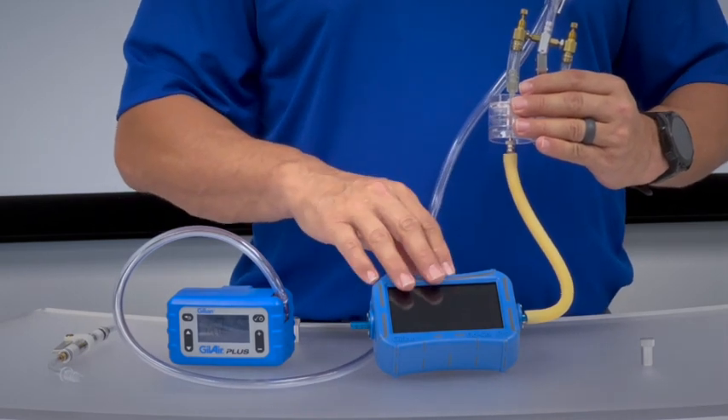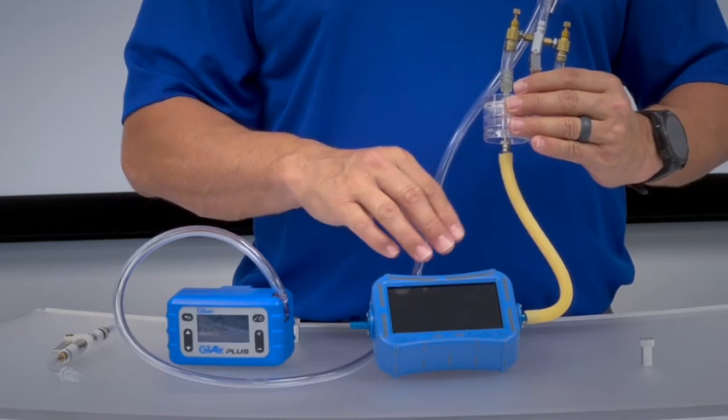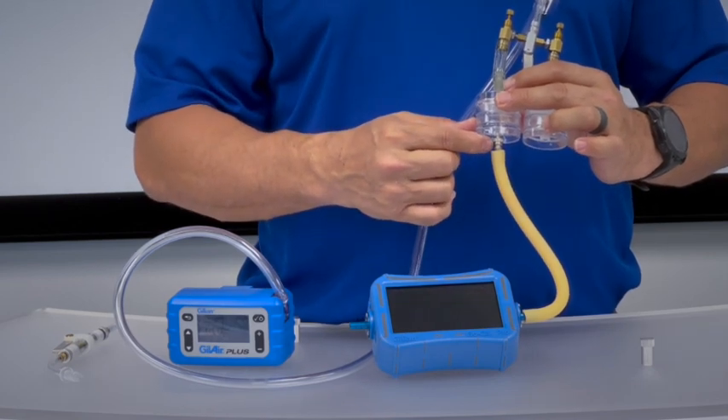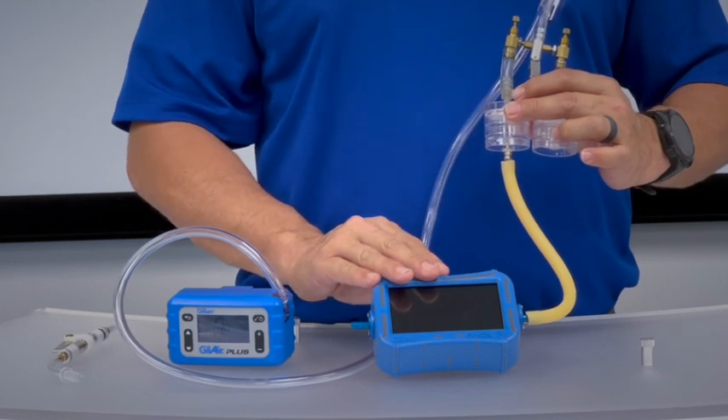Please note that to calibrate each one of the samples you will have to connect the calibrator independently of one another. Today we'll be using the Gillian Go-Cal Pro standard flow range flow meter.